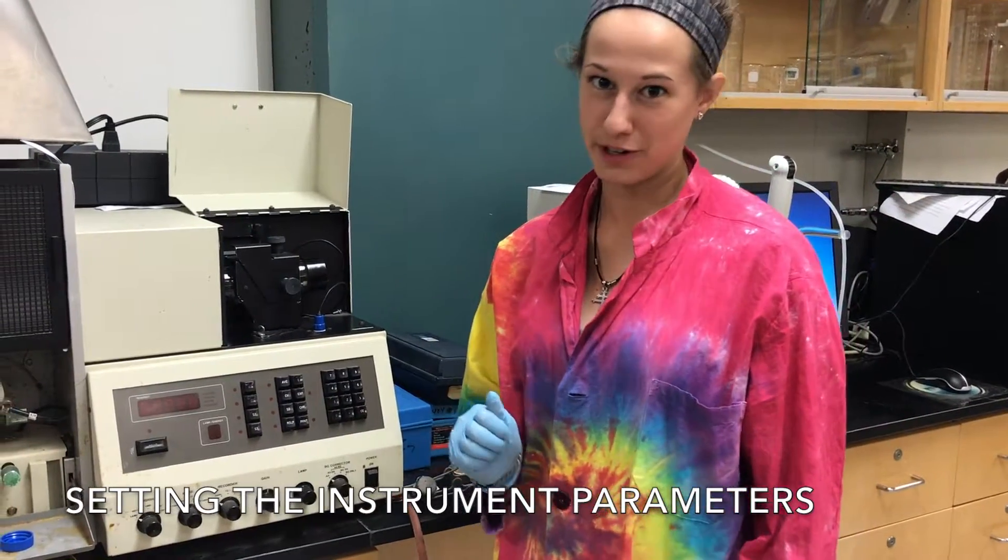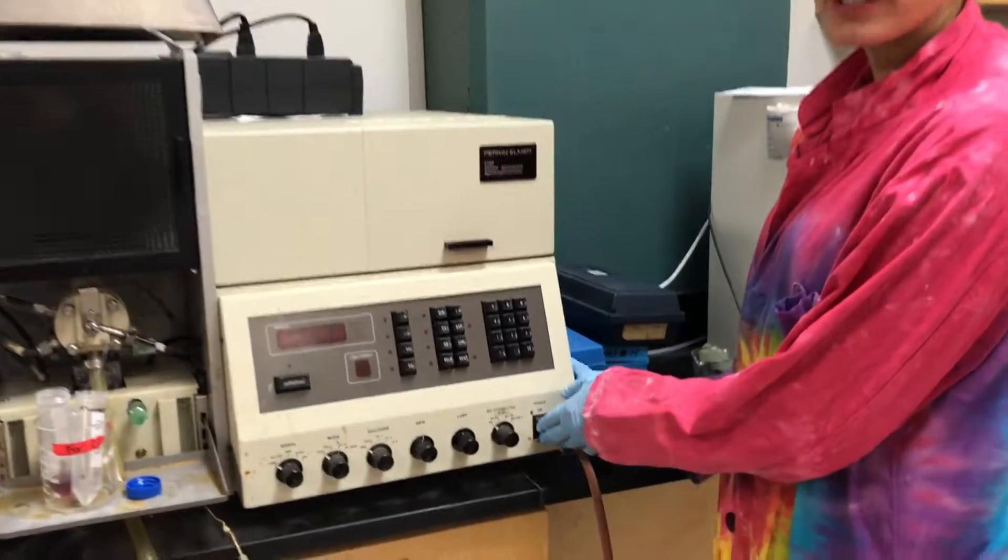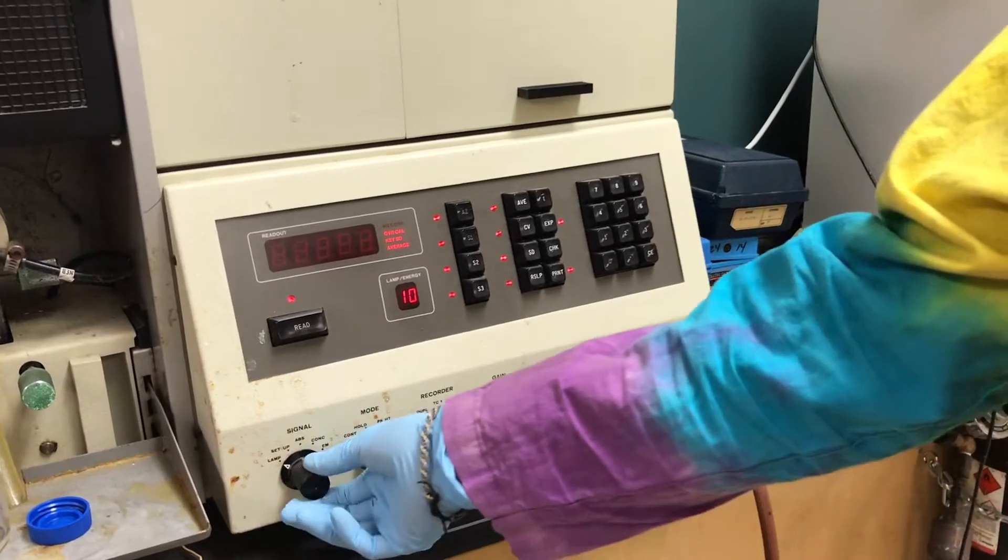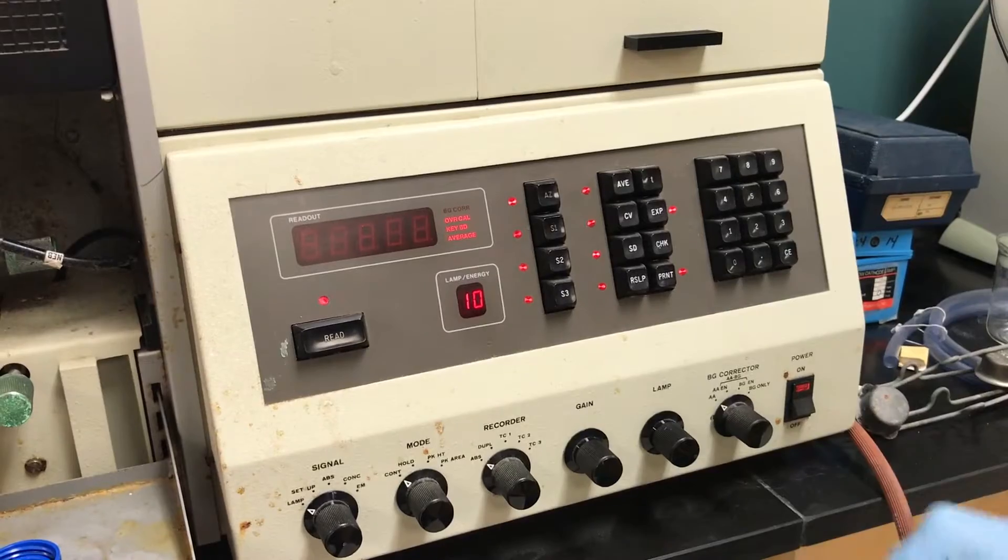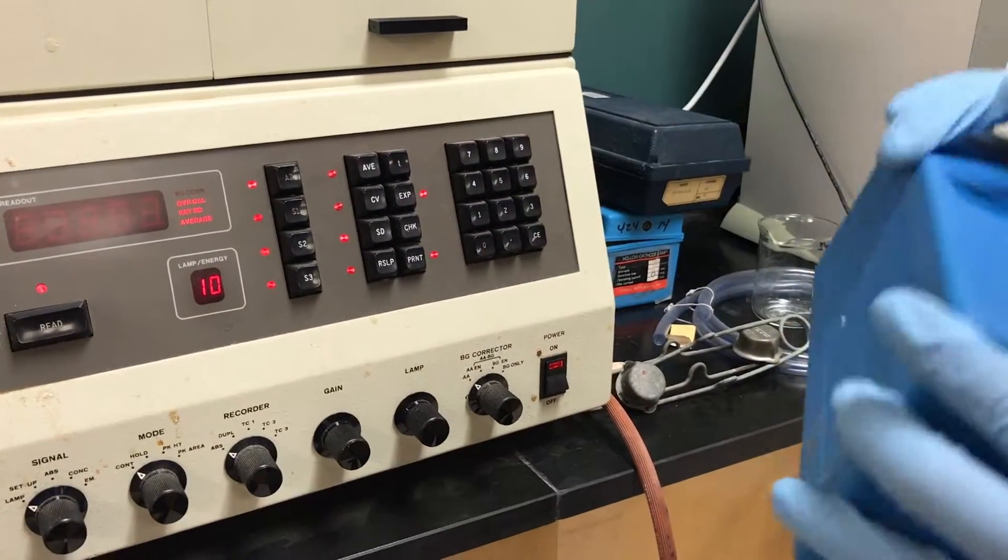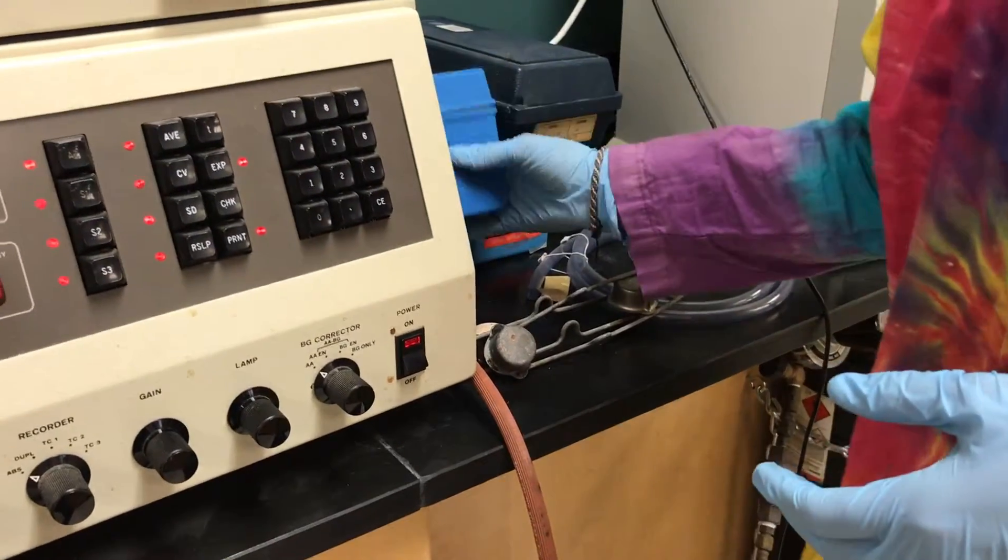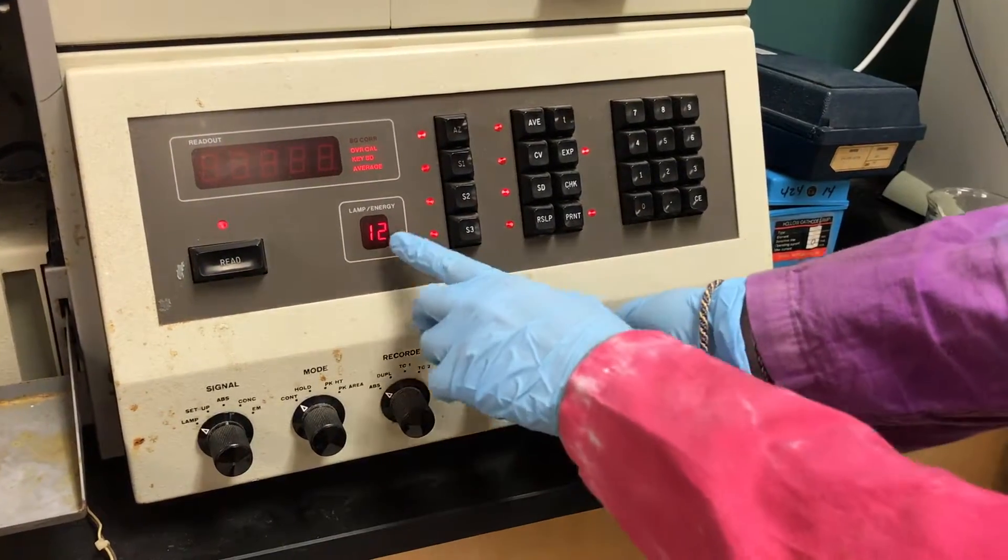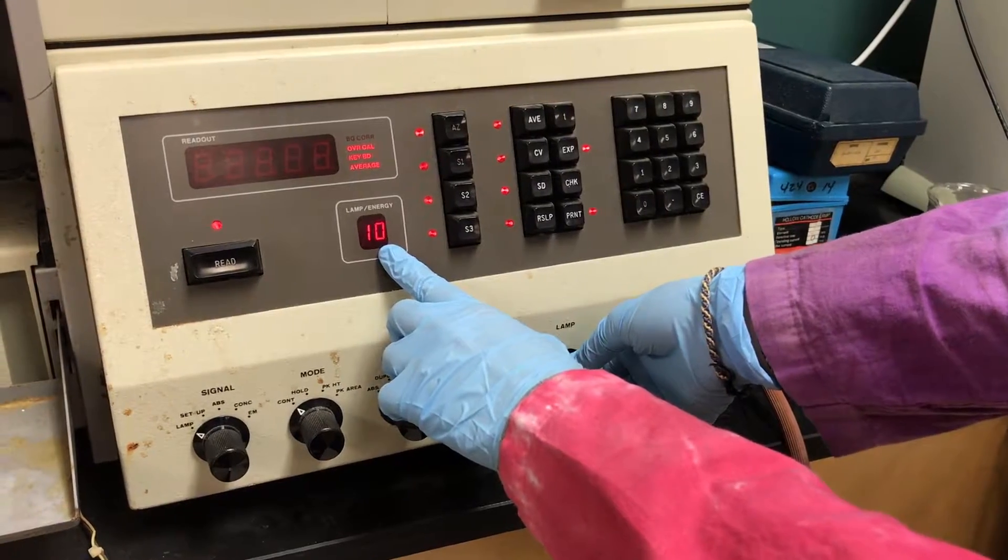Then, take the plug of the lamp and gently insert it right here. Now, we are going to set the parameters for our instrument. Close the lid, turn the instrument on, make sure all the knobs are set to the left. The first thing we need to do is set the current for our lamp. Looking on the box or on the lamp itself, we can find that the current is supposed to be 10 mA. So we're going to slowly adjust the lamp knob until the reading says 10. Like that.